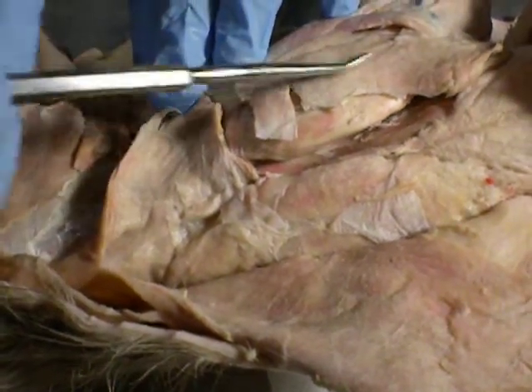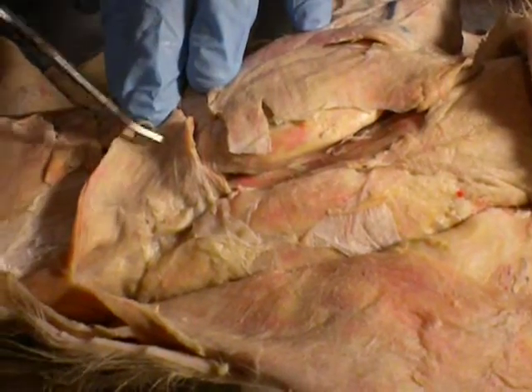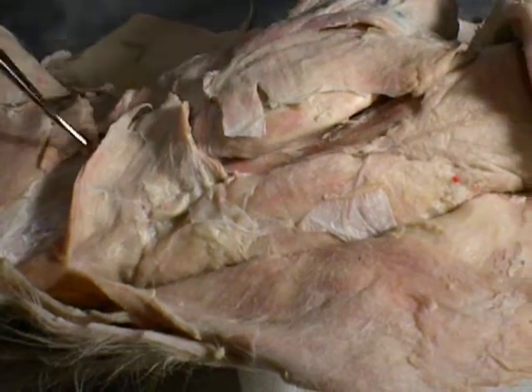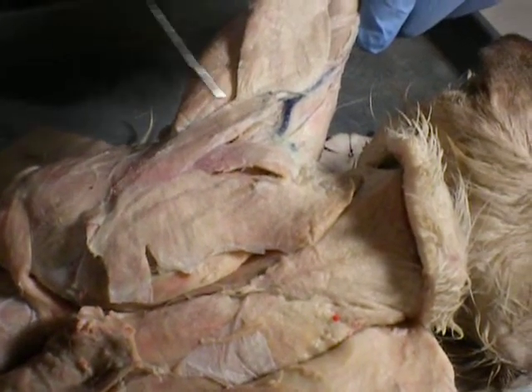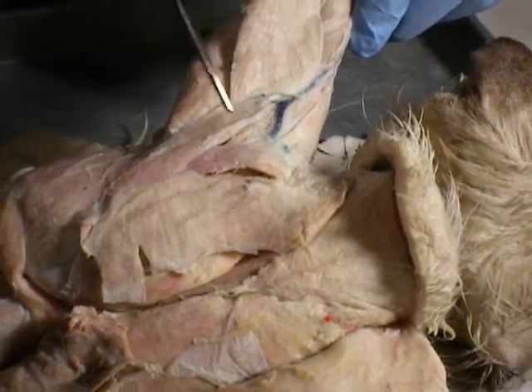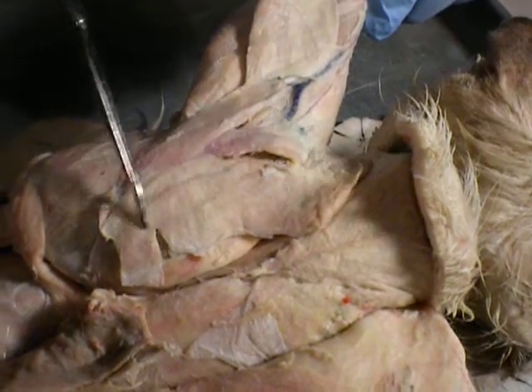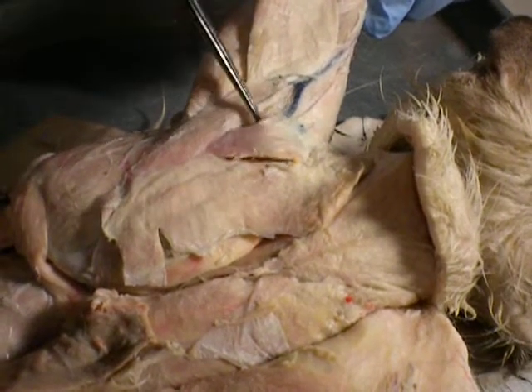If you see the striations on the acromiotrapezius, they're going this way. This is the spinotrapezius, connects straight to the spine. This is the spinodeltoid, goes in towards the direction of the spine. Acromiodeltoid, runs lateral with the acromiotrapezius.